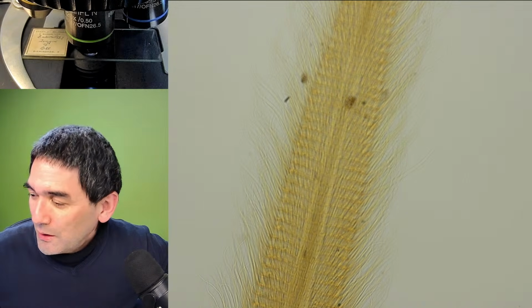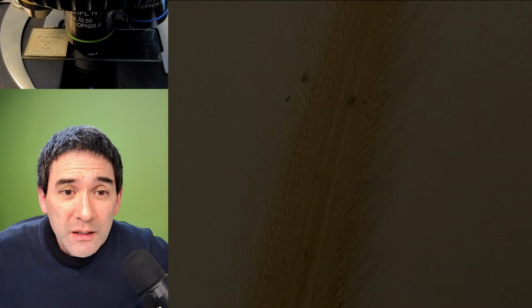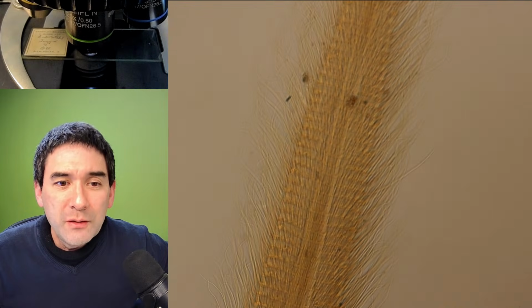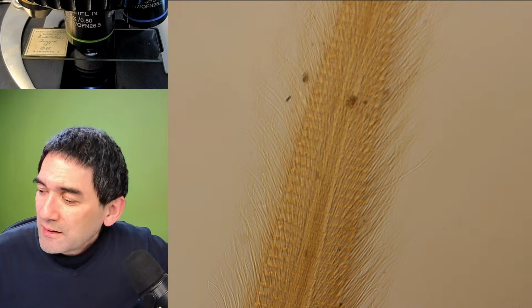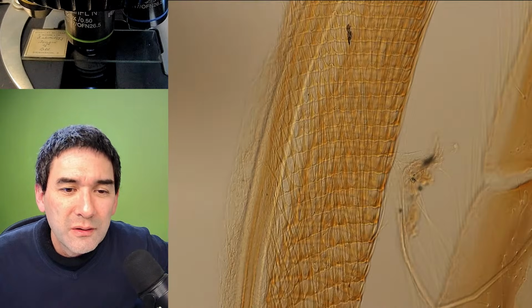So polarized, there was a request, I can do that. But I've seen with those prepared microscope slides that sometimes the DIC effect is not quite as big. A little bit here.